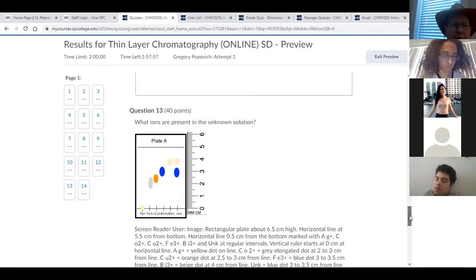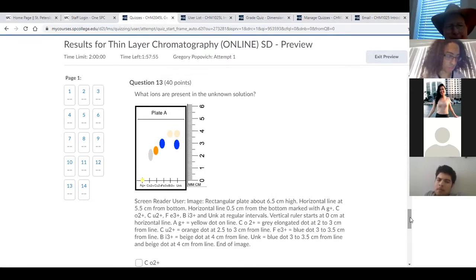Now, Faye, your question. All right. You're given this plate. Okay, Faye? Yep, I'm here. All right. You're given this plate, and this is the plate after it's been stained.